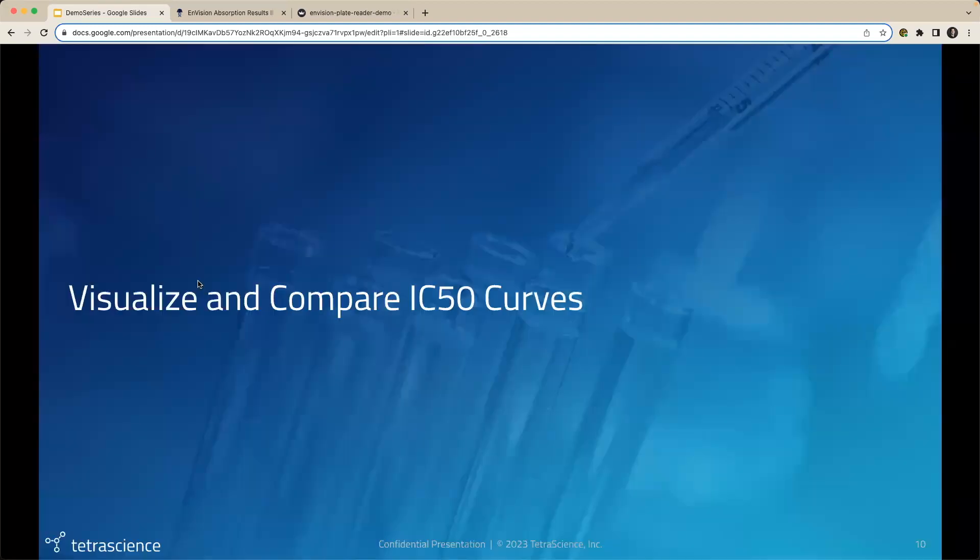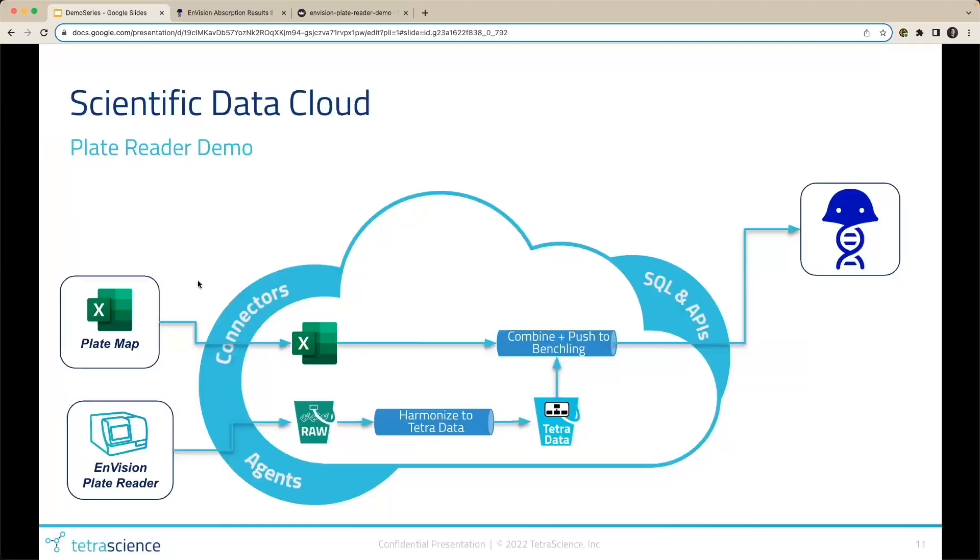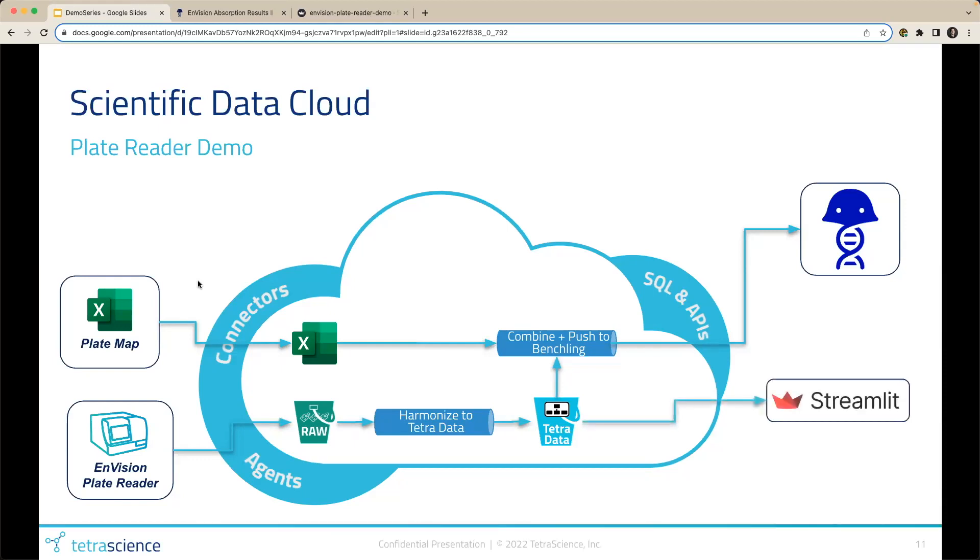Now, how can we analyze and visualize this plate reader data further? Now that our plate reader data is harmonized to Tetra data on the platform, we have endless possibilities. Streamlit is an open source Python based visualization tool that we use to build an application directly on top of the platform.